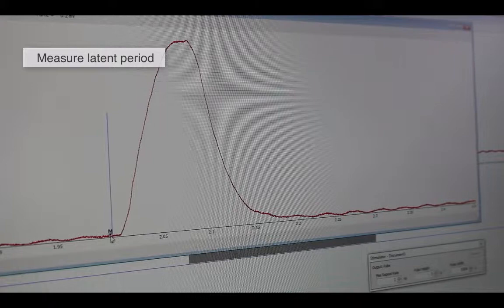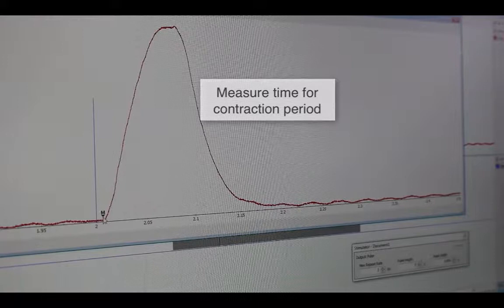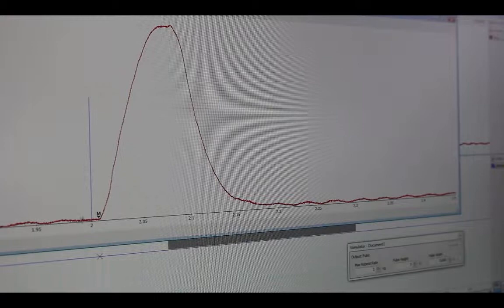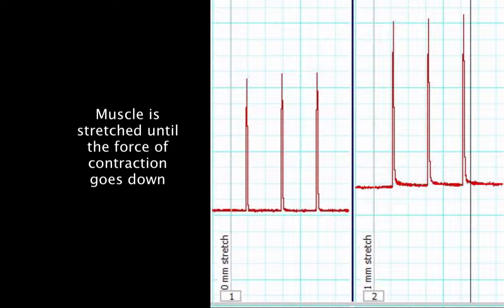To measure the latent period, the M marker is placed on the stimulus and the cursor at the beginning of contraction, and the change in time measured. To measure the time for contraction, the M marker is placed at the beginning of the contraction period, the cursor at the top, and the time between those two is recorded. To measure the relaxation phase, the M marker is placed at the top and the cursor at the bottom is recorded.